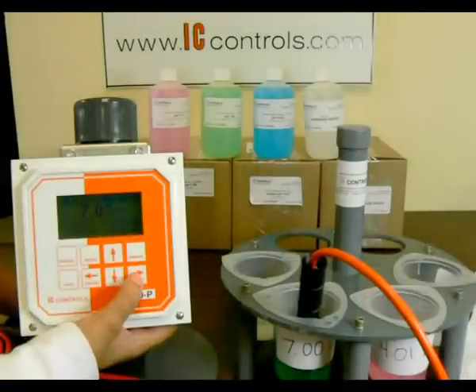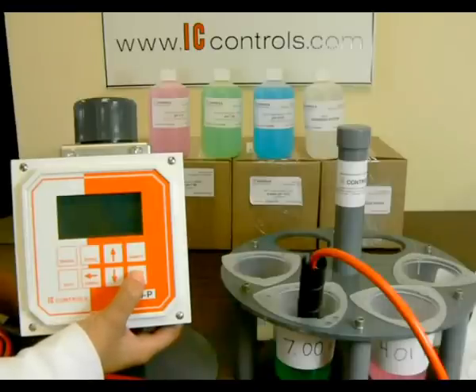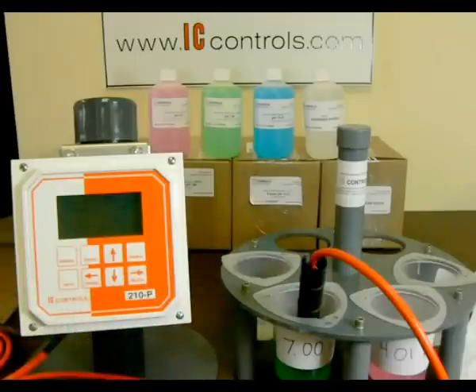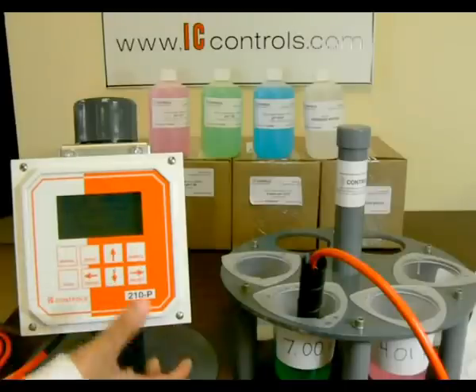Calibrate using your IC Controls pH analyzer. Select pH, Calibrate, Buffer 1, 7 pH. Wait for the analyzer to accept the calibration and select sample. You should receive a reading of 7 pH. It is okay if your reading is off by as much as .02.